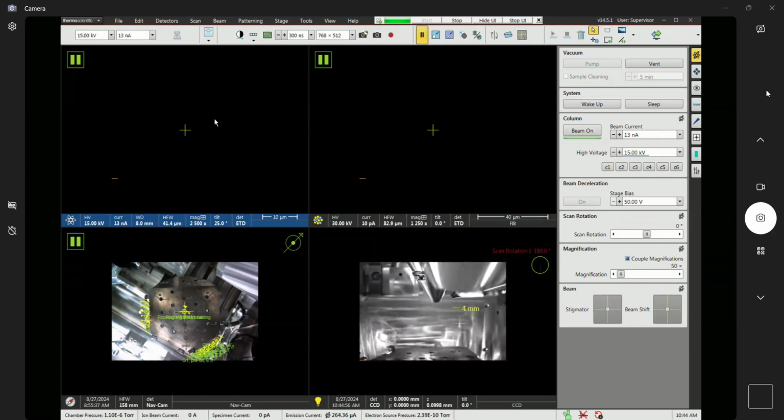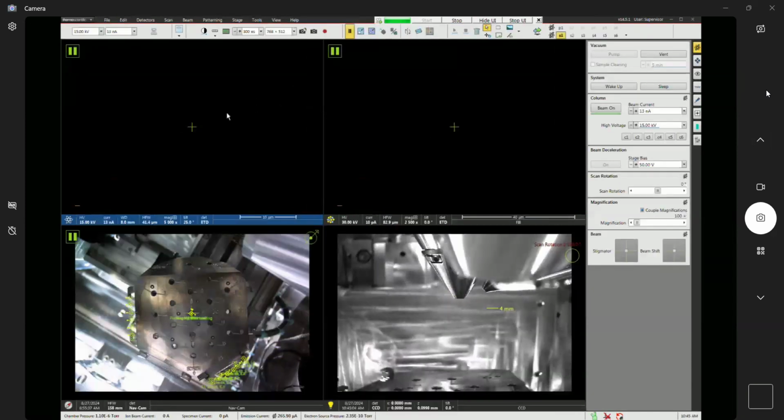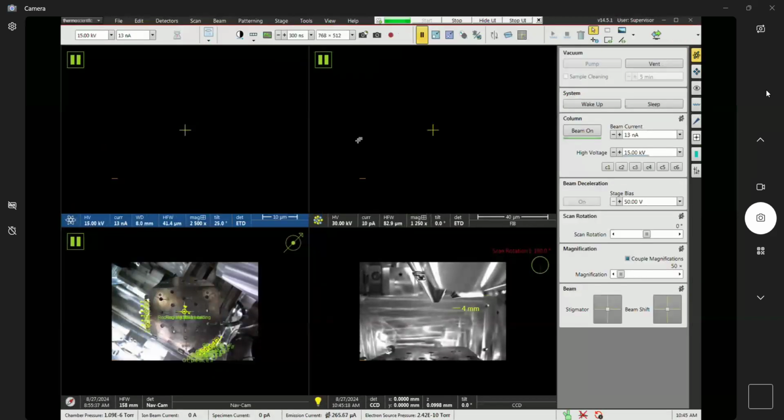Okay. So as I have to do here because of the screen capture thing, I just need to change this view. That's going to make it a little easier to see the quads here, although it makes it a little harder to see what's here with the text. All right, let me put this back. Okay. And if we need to swap it out, we will, because it's a little easier to see this.